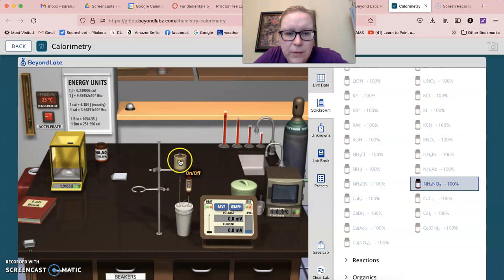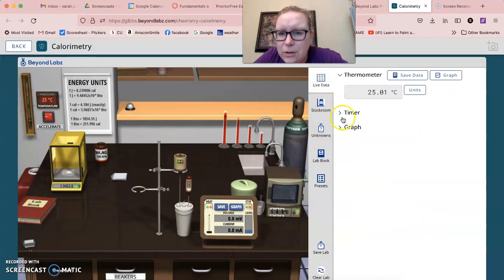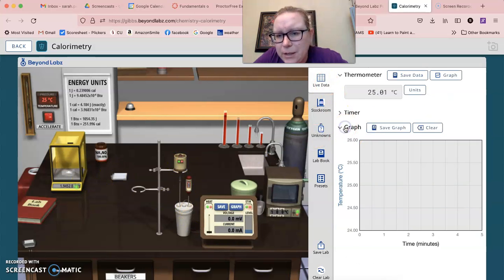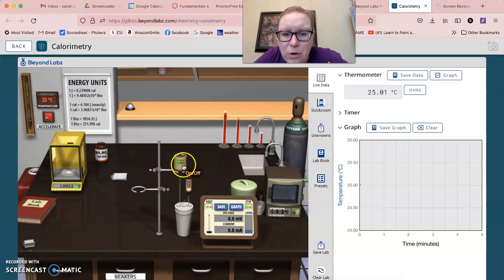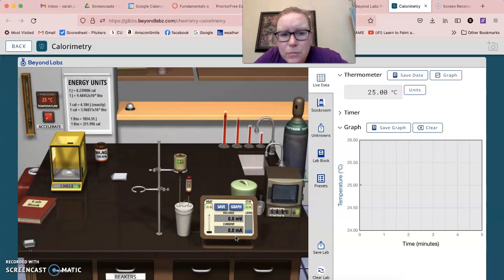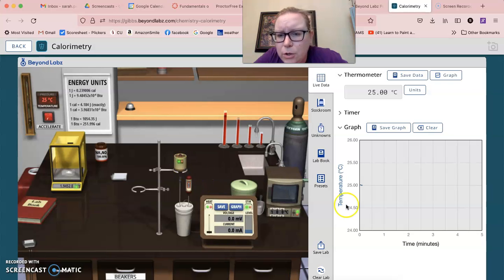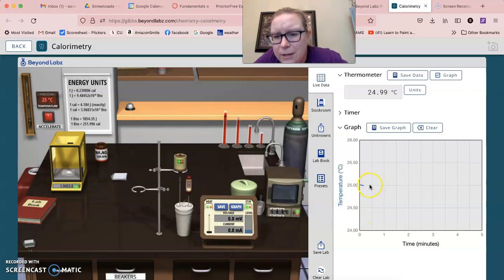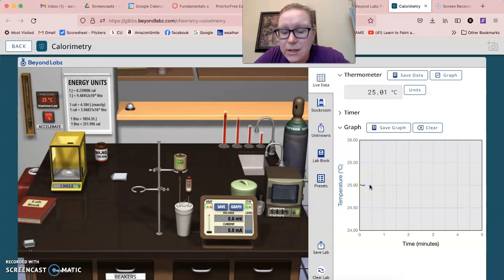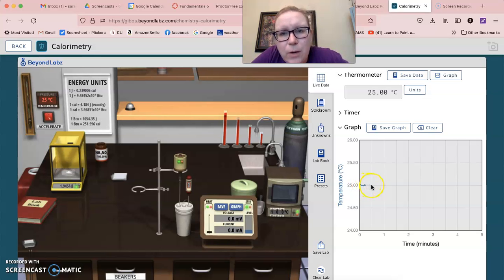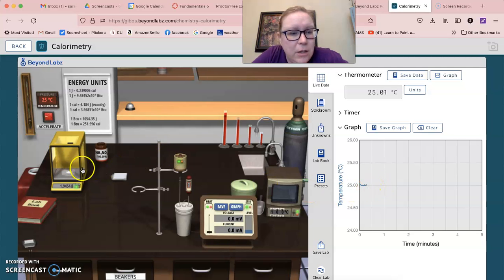And then what you've got to do is you have to come here to the live data. We can come down to the graph and you need to go ahead and turn this on. And so when you turn it on, you should start to see some of your data here. This is the baseline data. This is where your water is. And so you want this to run just a little bit.